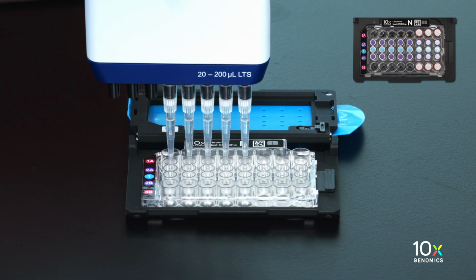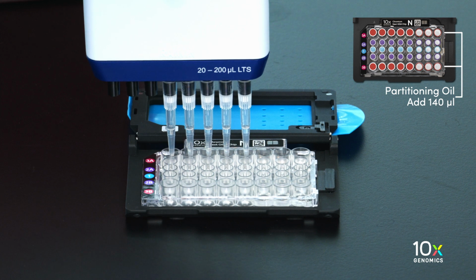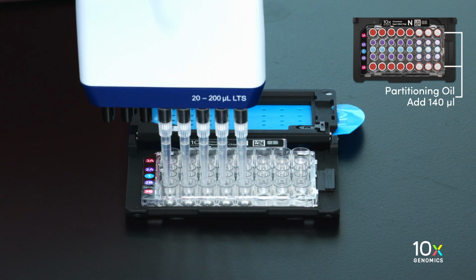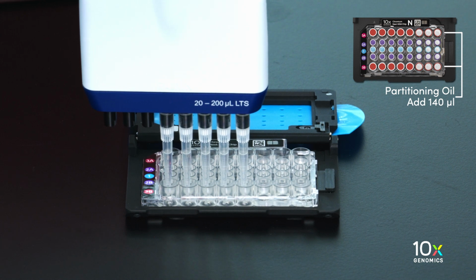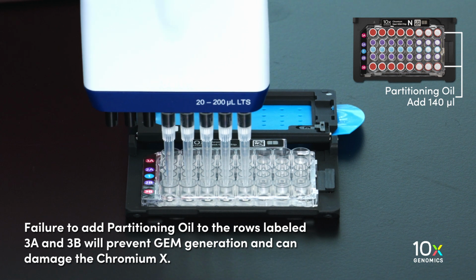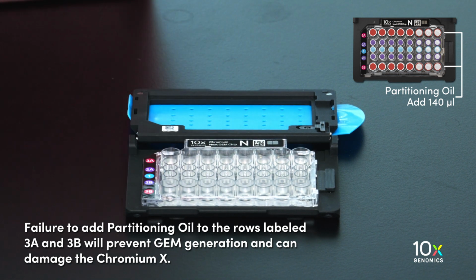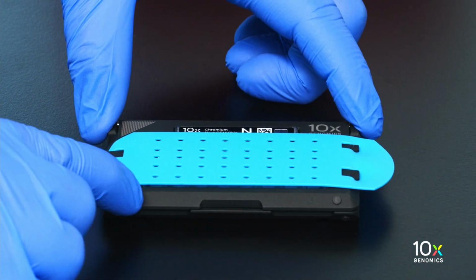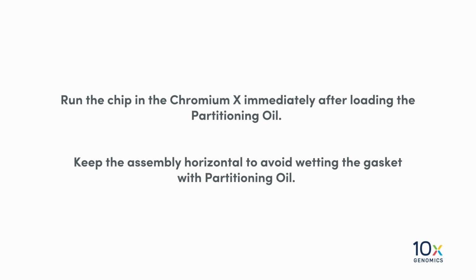Dispense 140 microliters of partitioning oil into the wells in the rows labeled 3A and 3B from a reagent reservoir. Failure to add partitioning oil to the rows labeled 3A and 3B will prevent gem generation and can damage the Chromium X. Close the lid with the gasket already attached. Run the chip in the Chromium X immediately after loading the partitioning oil. Keep the assembly horizontal to avoid wetting the gasket with partitioning oil.